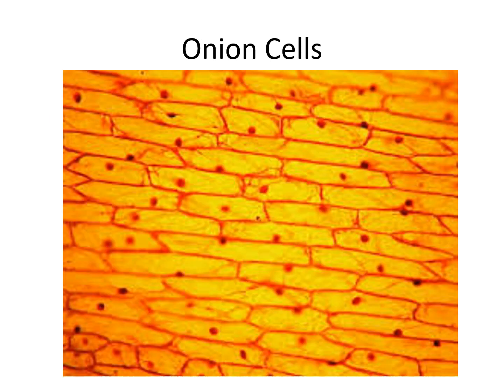You will also observe some plant cells in the form of onion cells, and for this you should be able to identify the cell wall, which will be the nice rigid structure that looks sort of like bricks, and again you should be able to see the nuclei, the nucleus, because that's the most visible organelle.